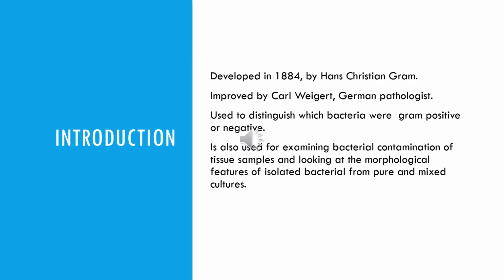Developed and named in 1884 by Hans Christian Gram, a Danish physician who had studied lung tissue sections of patients afflicted with pneumonia, and further developed by Carl Weigert, who added the safranin staining step. It is used to tell if bacteria are gram-positive or negative, as well as aid in examining bacterial features.